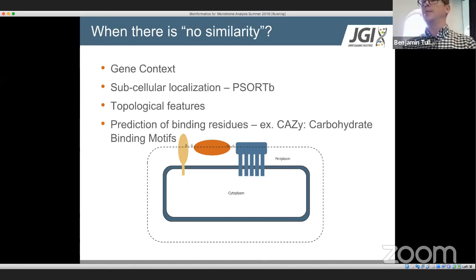And so there are a couple of other databases like that. Another example would be the MEROPS database, which does that for peptidases. And so these are highly specific databases that are somewhat manually curated at this point. Some of them are automated as well. They're elements of both that give you specific functionality outside of the realm of homology that might not match in a database.